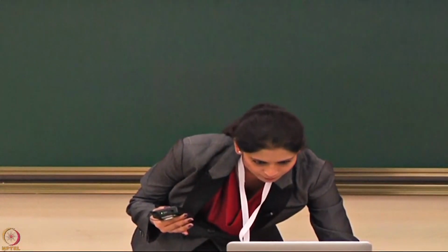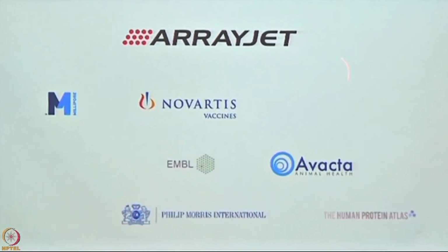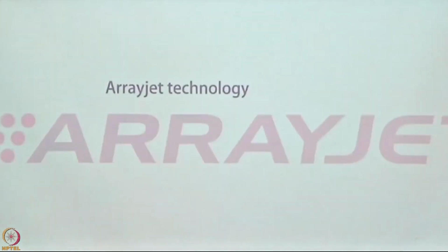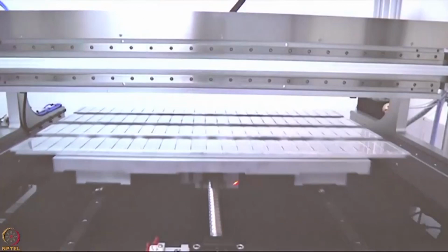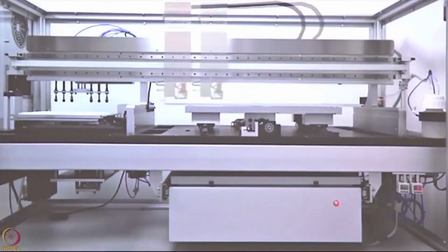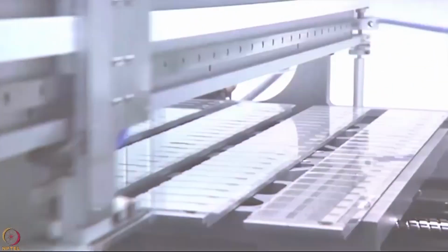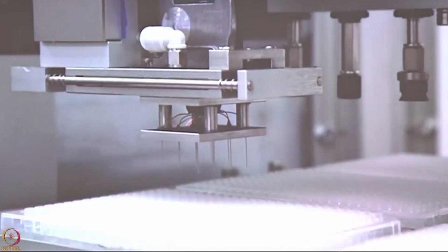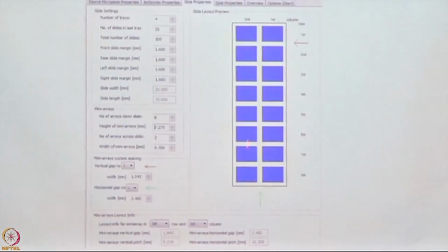Let me show you another video. This is how we have used a variety of different platforms or surfaces. This is the one that times you. So, this video will give you a little bit of a timing. This is in fast motion, but within a minute you can have your entire panel of antibodies quickly printed. And you see how this is moving. This is how the aspiration takes place. Your sample goes inside the print head. Then this is where it ejects out.